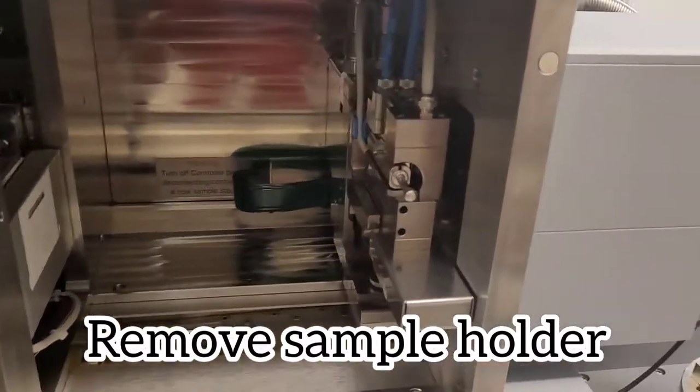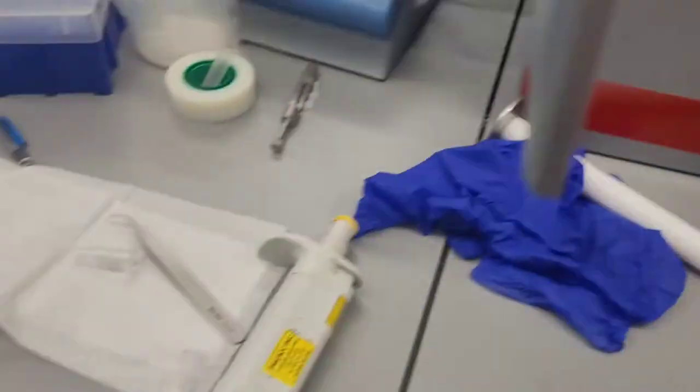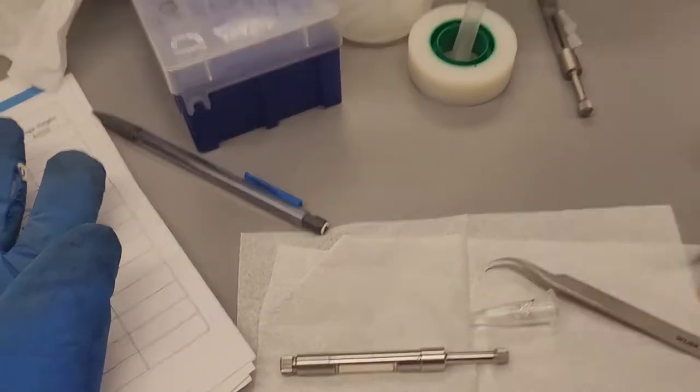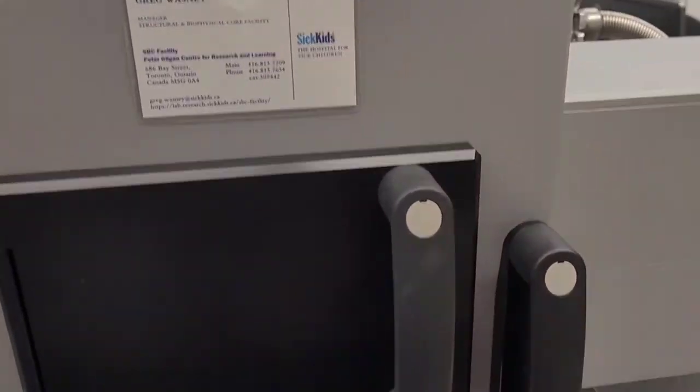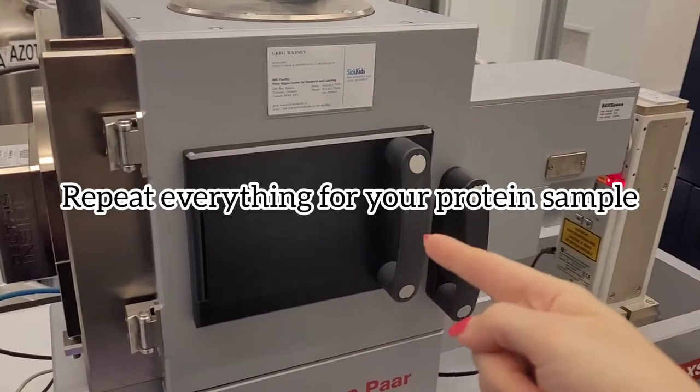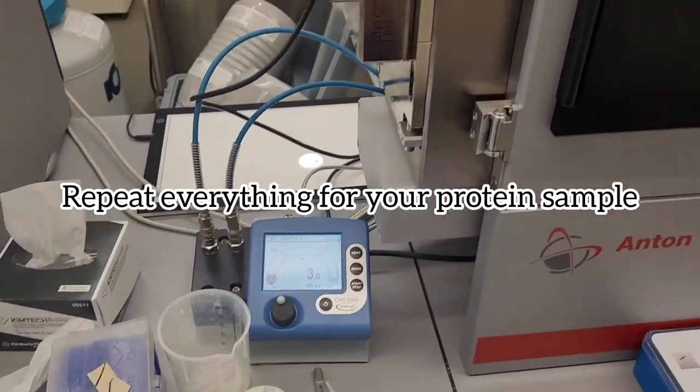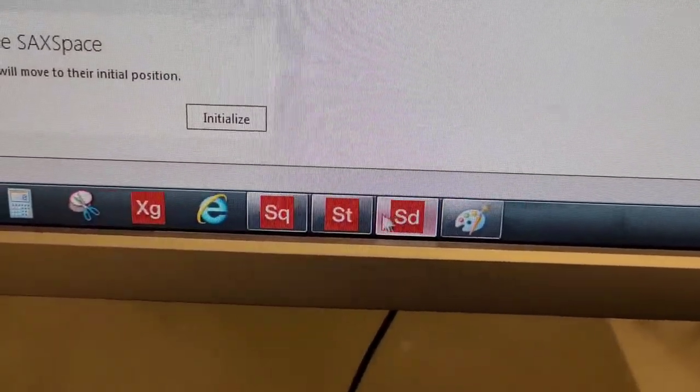Then I undo the vacuum and take out my sample. Doing everything in reverse. Always make sure you don't actually touch the capillary itself which is in the center. And then I do the same thing for my sample and I run that.